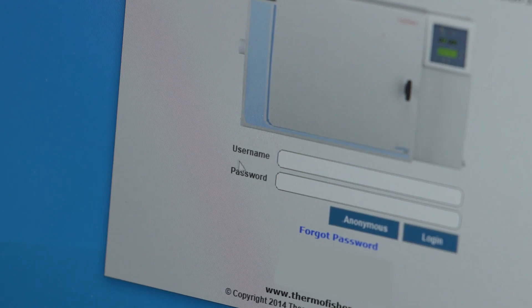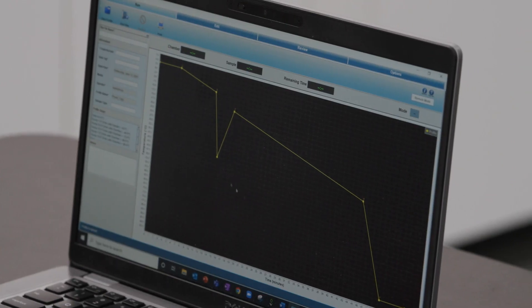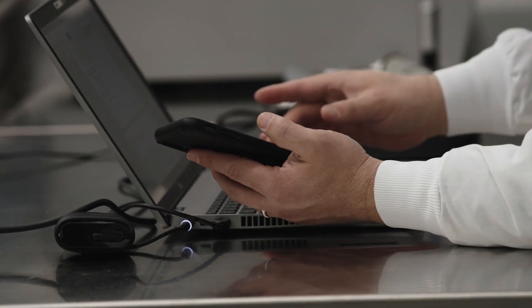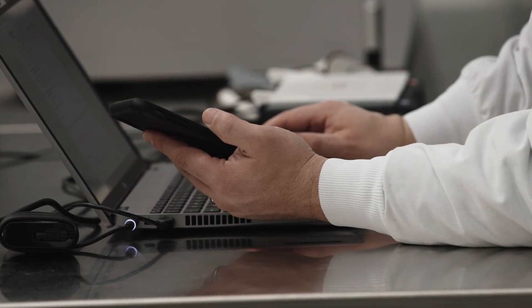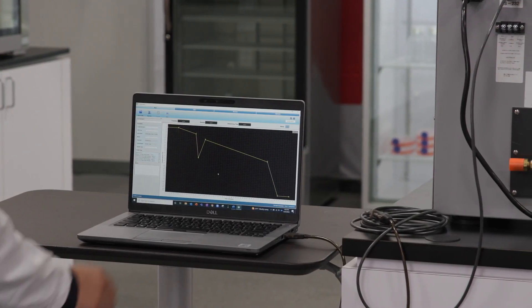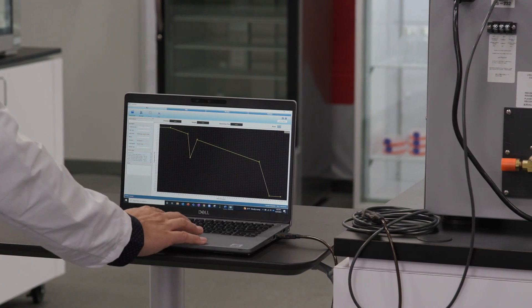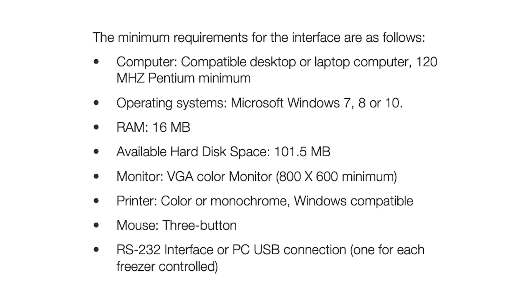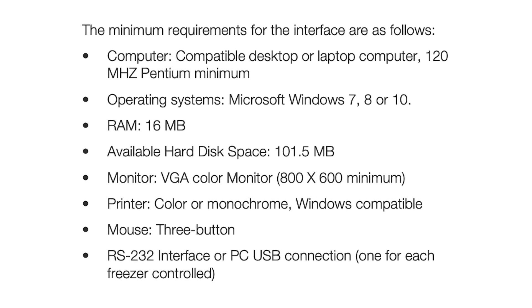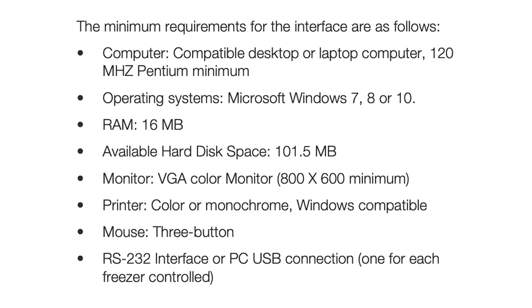The Cryomed Controlled Rate Freezer also includes the PC Interface Companion software. The PC-based software enables the user to create and download freezer profiles. The software allows users to remotely initiate a profile run, monitor the run progress, detect and respond to error conditions, and it also enables users to print a report summary of the run data. Start by confirming the minimum requirements for the software pertaining to operating system, memory, disk space, and a USB port.